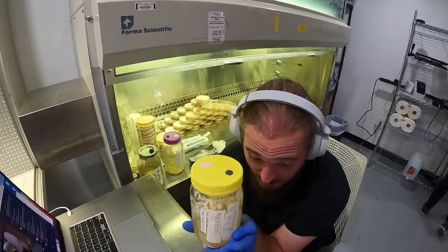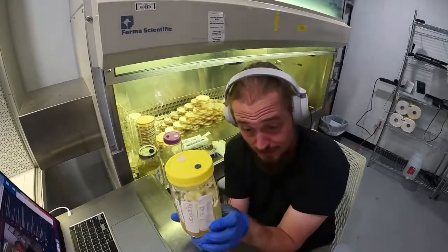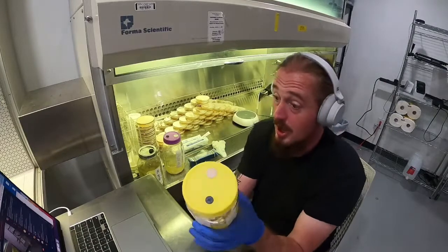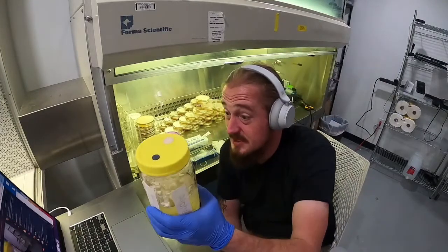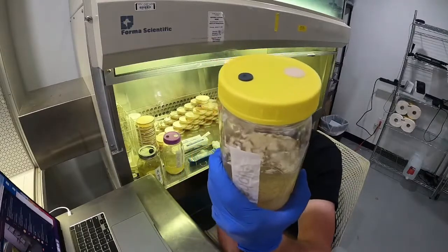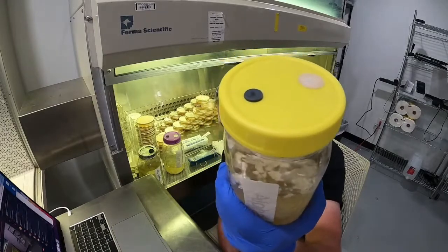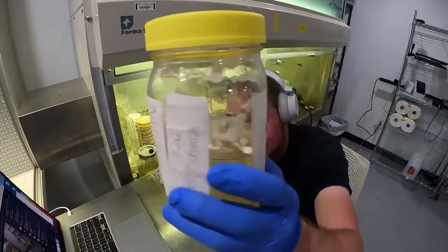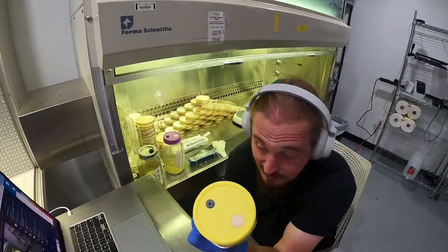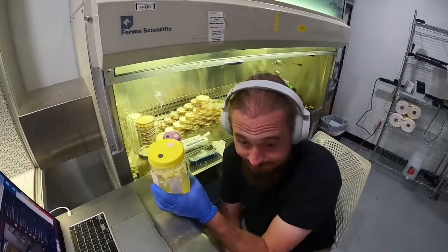That is the agarikon mushroom. If you're a fan of Paul Stamets, you know that this is the god mushroom. You know that this is also an endangered species. And what that is, that's not infection. That's not contamination. That's pinset. I have the agarikon mushroom pinning on my liquid culture. See? I could actually fish one of these out, clone it.